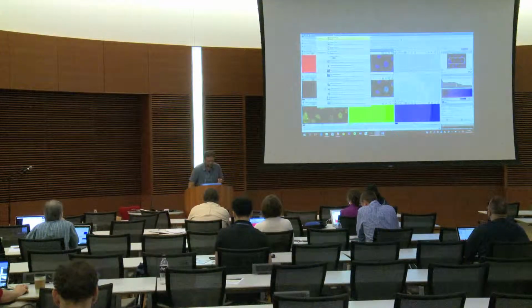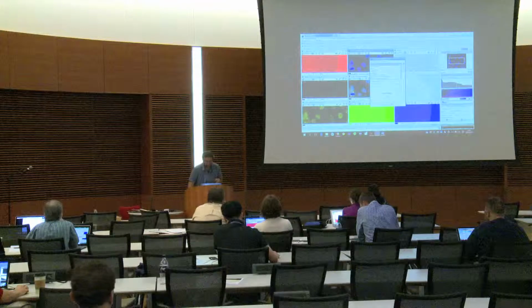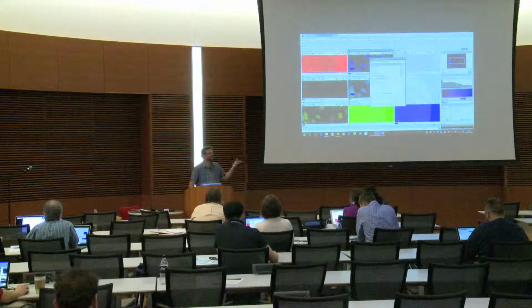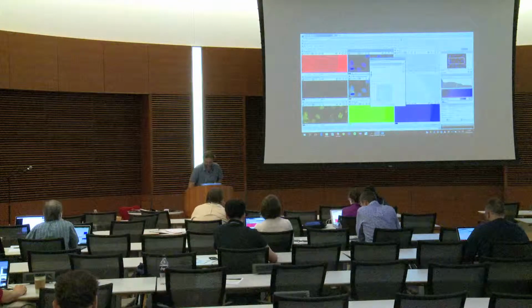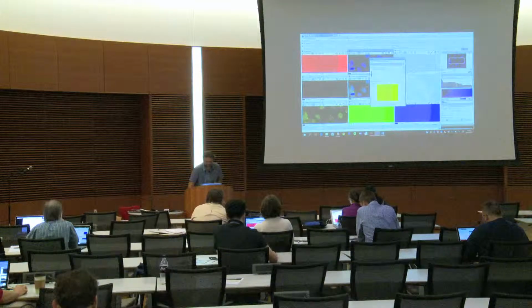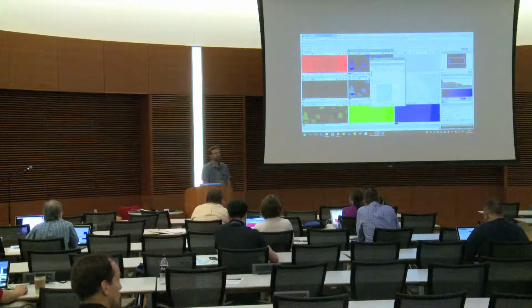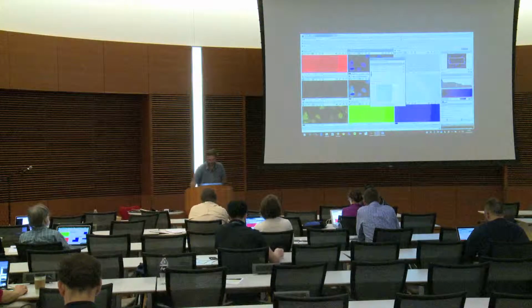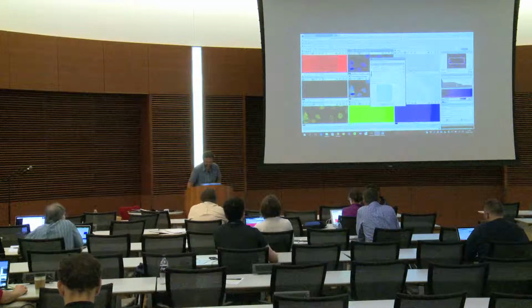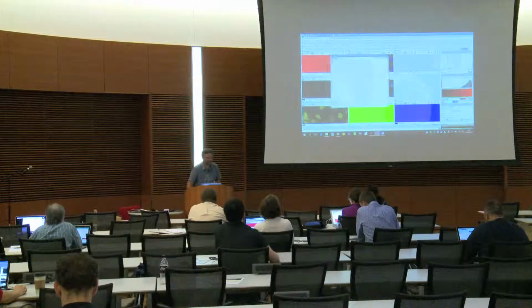So here we want to merge a channel. You click here, and if you want to rebuild, for instance, the first image P7, you select the channel 0, the channel 1, and then the channel 2 of P7, and here you have a preview of what it's going to be. Okay? And then here, if you press OK, you will have the original image that is built back.